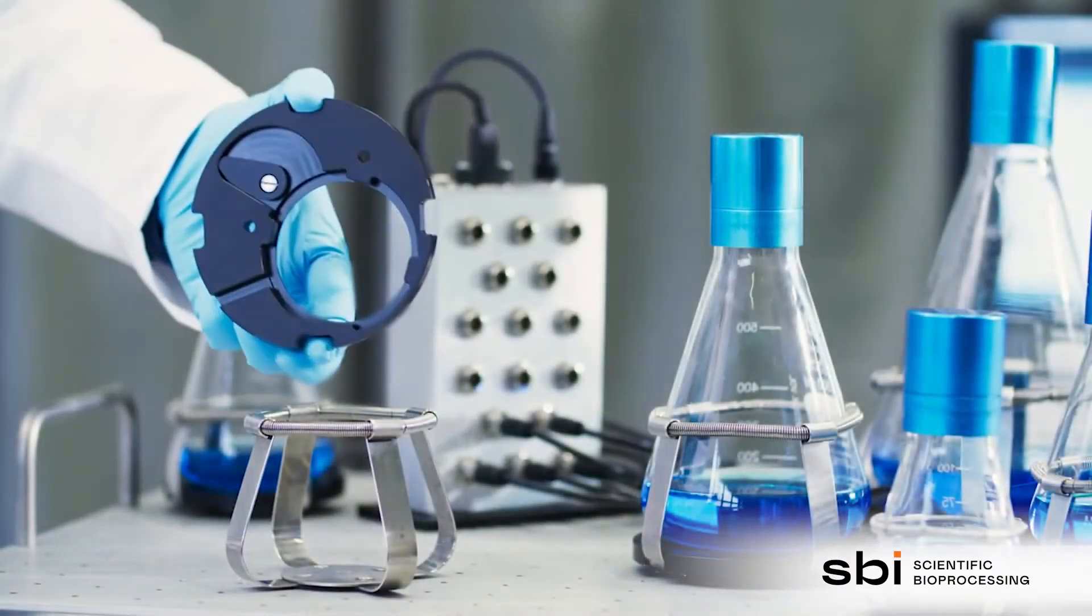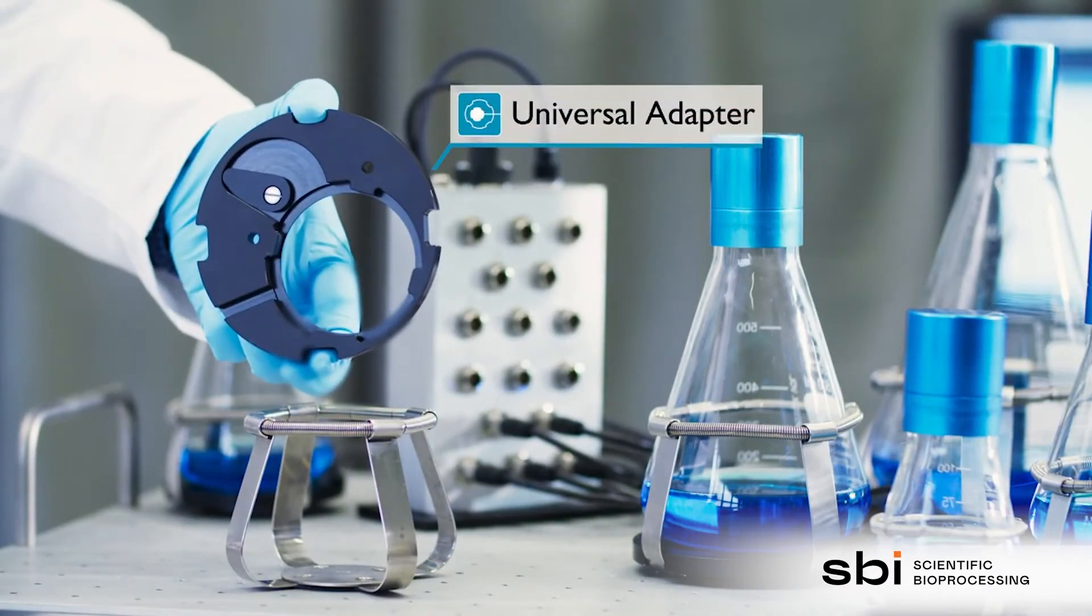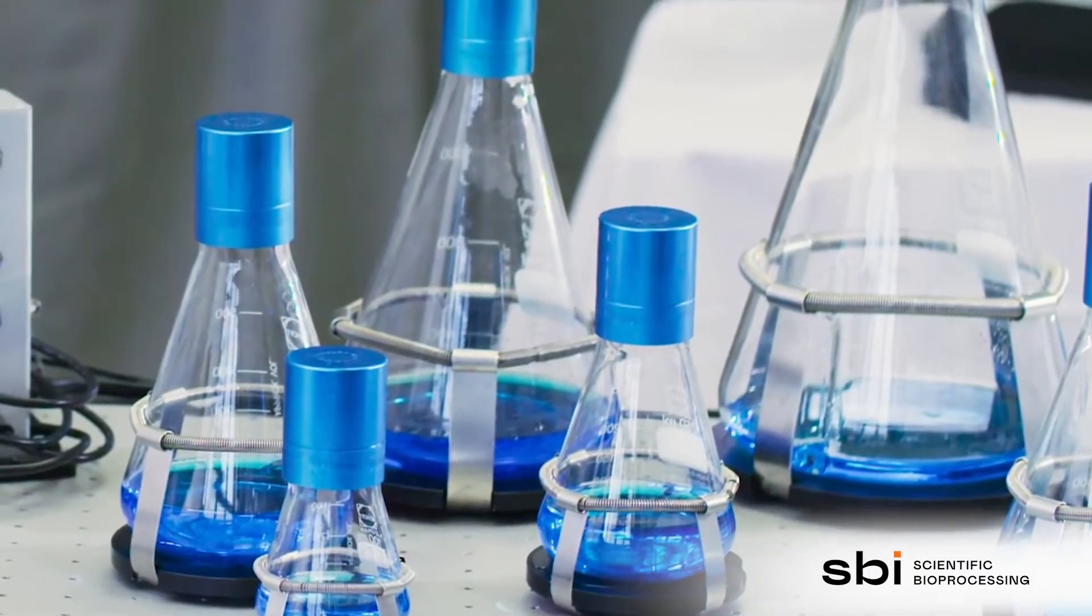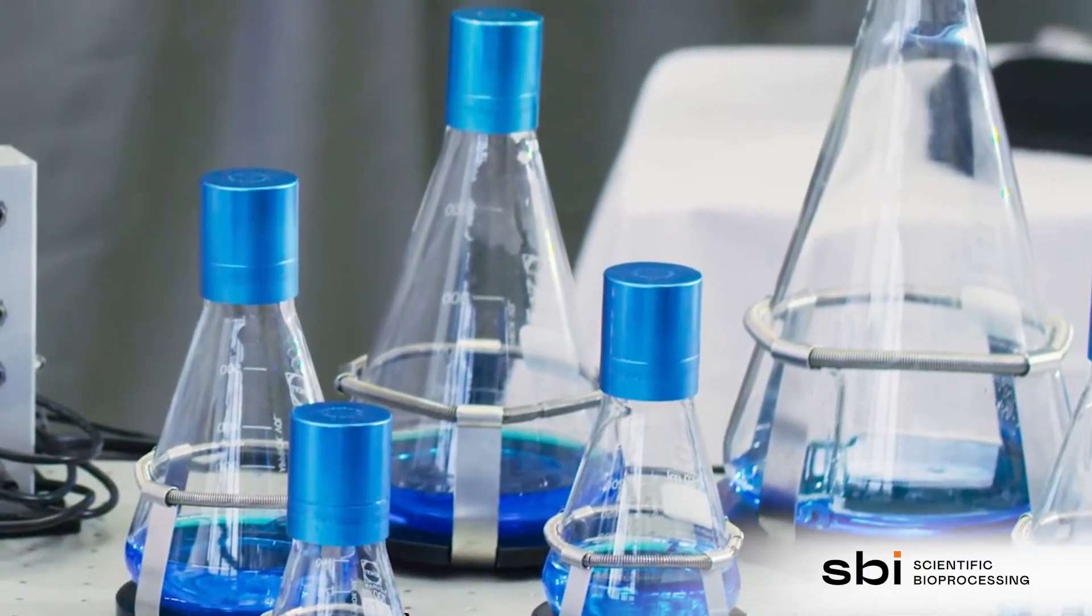By applying a suitable universal adapter, the sensor plate can be used for various shake flask sizes ranging from 100 up to 5,000 milliliters.